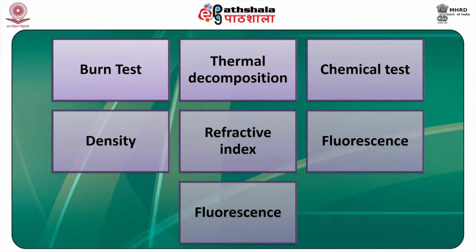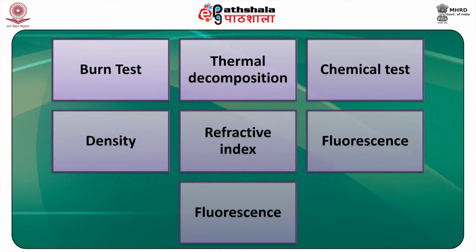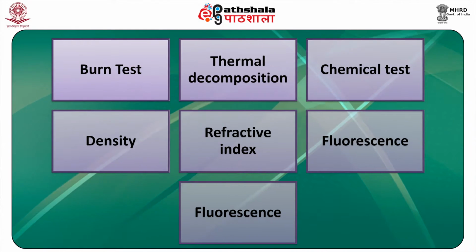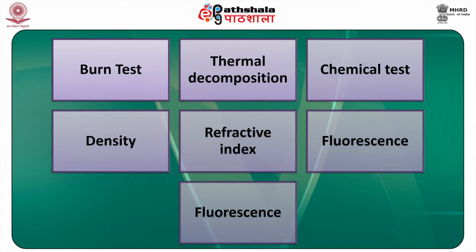Investigators measure the refractive index of an unknown sample with liquids of a known refractive index. Place the sample in different liquids until the Becke line is no longer visible.